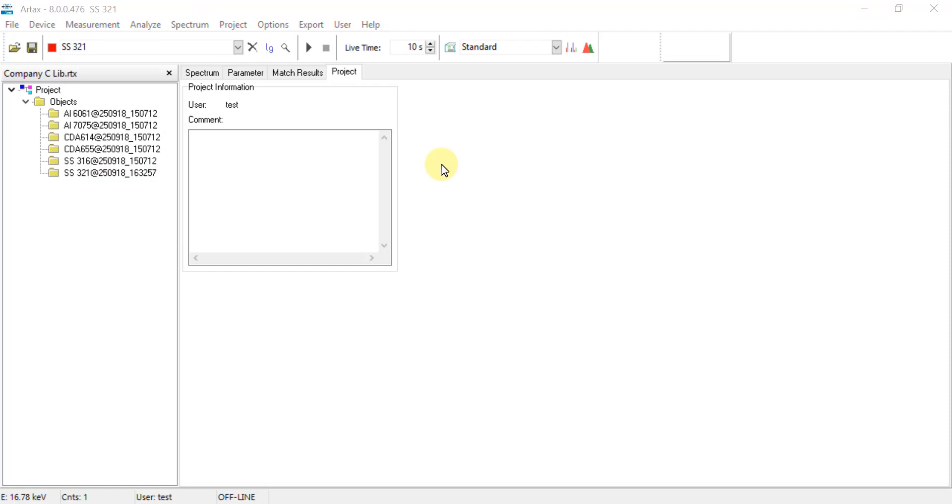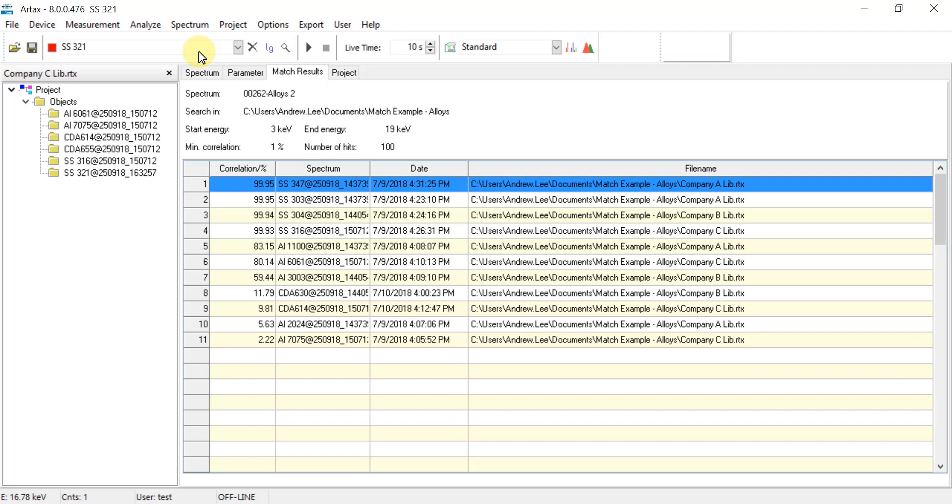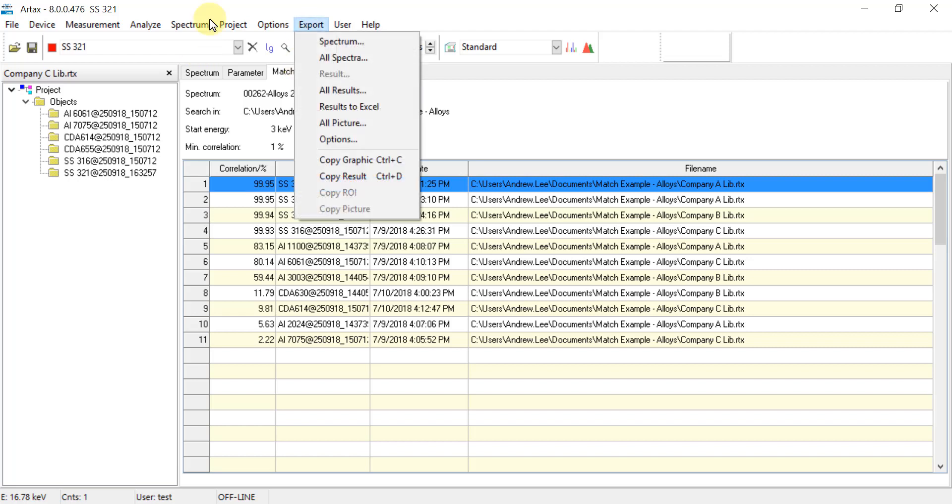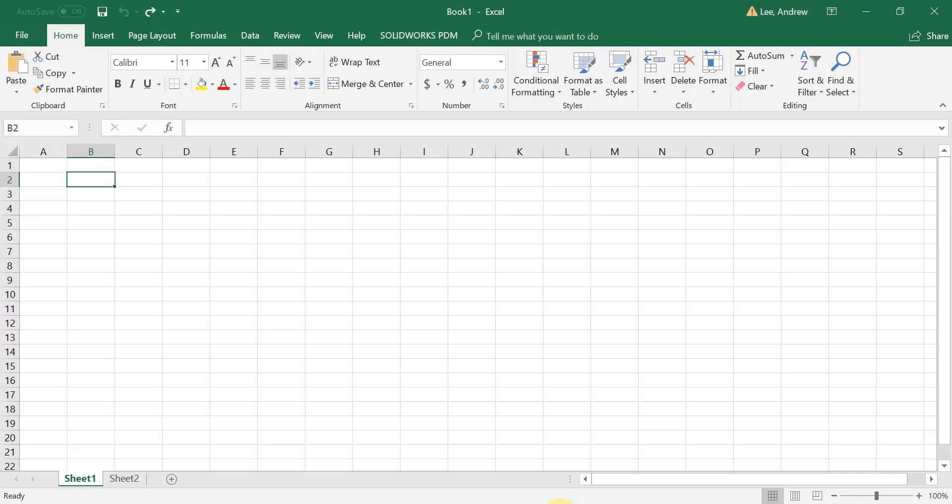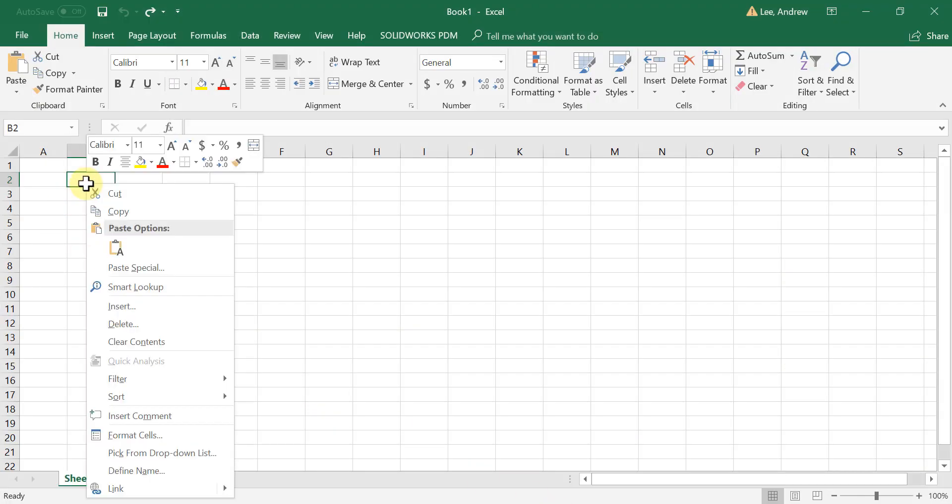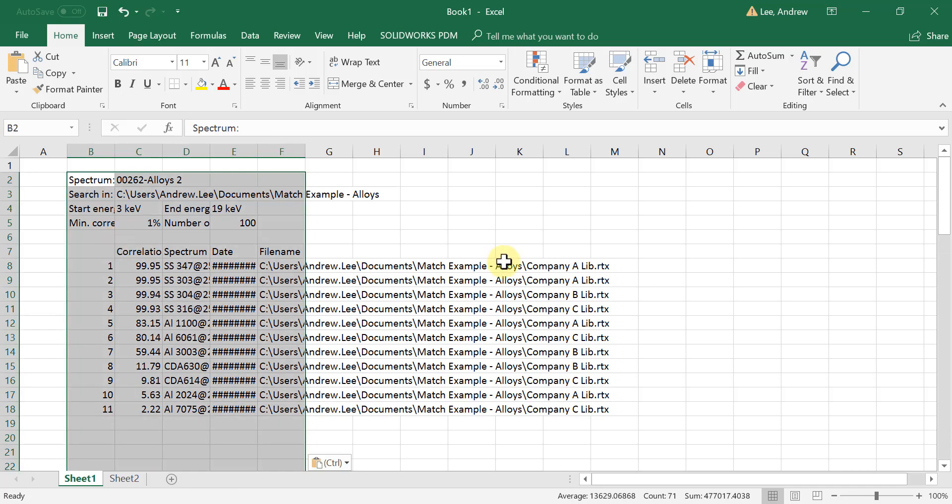To export these results into a report, select the Match Results tab and then go to the top menu and select Export, then Copy Result. And now the results are ready to be pasted in any document such as Excel, where the results will be pasted in the document in the same format as they were displayed in the software.